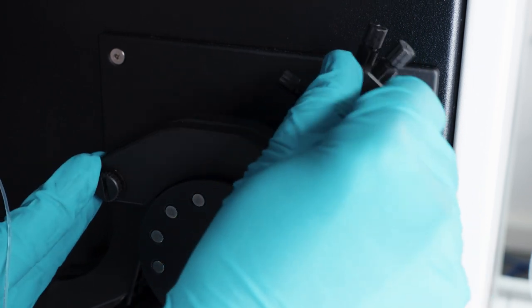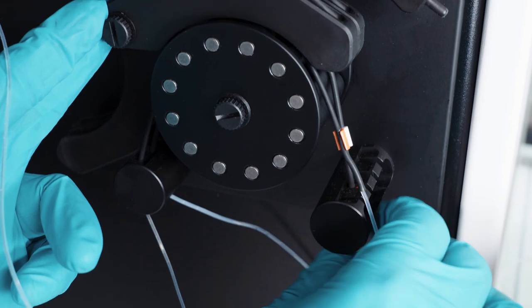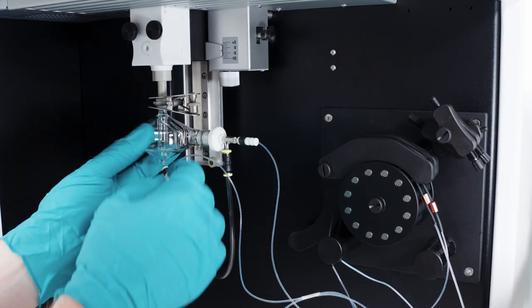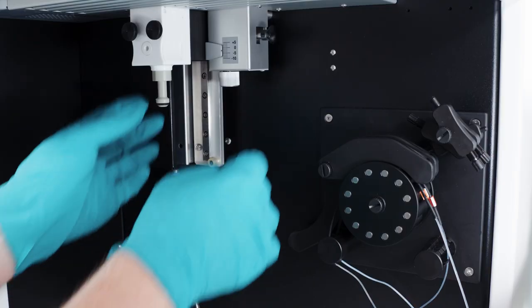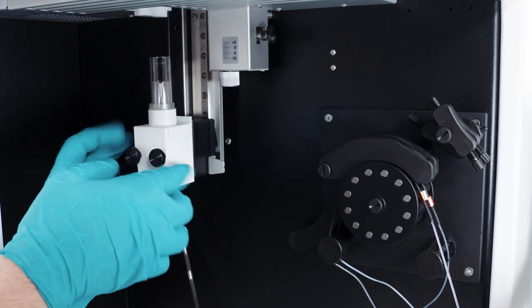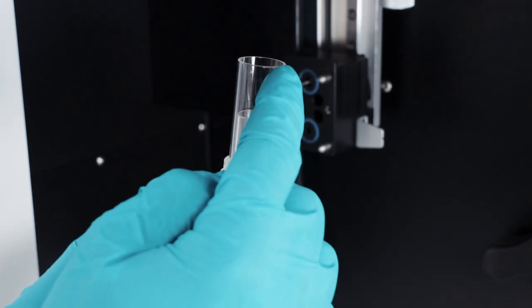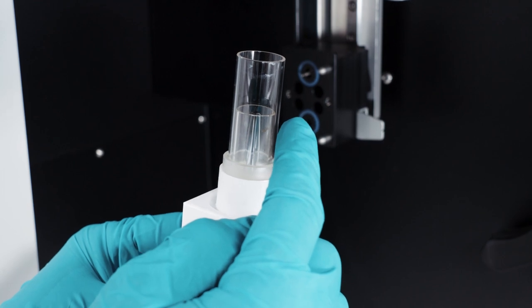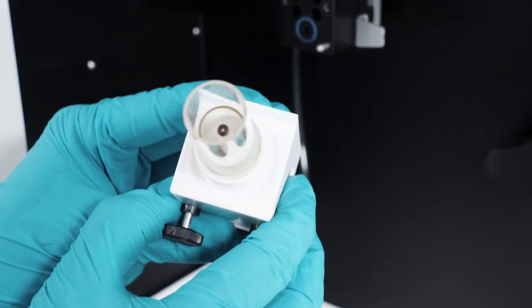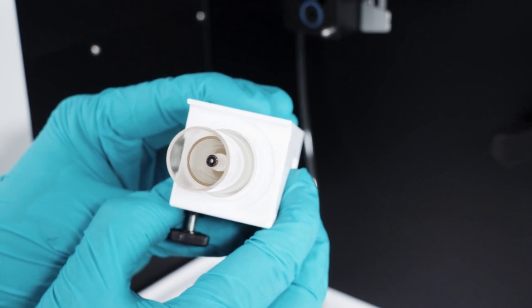Especially for the analysis of organic samples, the entire torch system should at least be subject to a daily visual inspection. Typical places for contamination are the upper part of the outer tube and the tip of the injector. Any carbon deposits have a severe effect on the measurement sensitivity, since the injector tube can be gradually clogged.